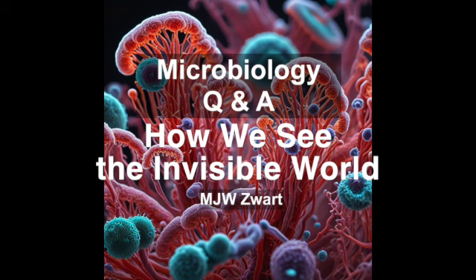This is already so much to take in, and it feels like we're just scratching the surface. We are. But before we get too overwhelmed, let's talk about two key concepts that are often confused: magnification and resolution. They may sound similar, but they're actually quite different. Okay, I'm all ears. What's the difference between magnification and resolution?